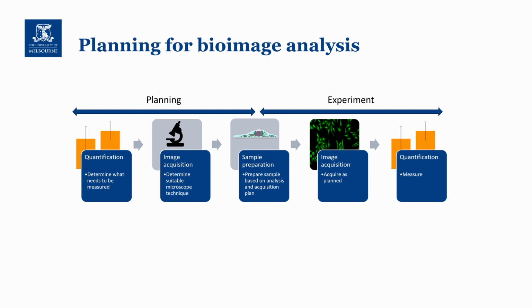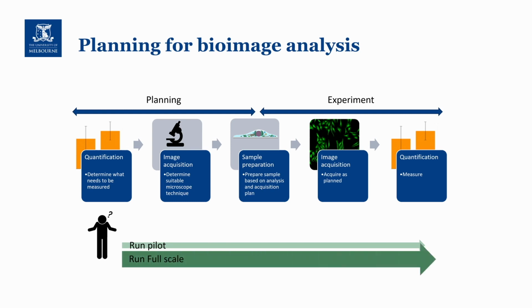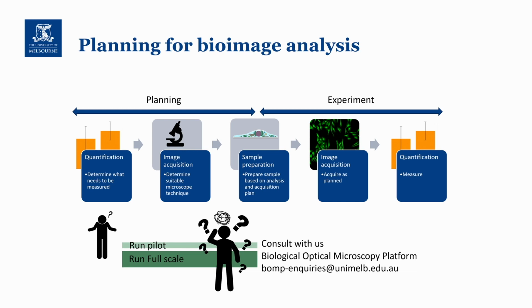So sometimes we might not know what feature we want to measure because the actual biology may be unknown or we are unsure how to measure it. So we should always carry out a pilot study before undertaking a major experiment. Also, if you're unsure if a microscope's specifications will be suitable for your image, it's another good time to run a pilot study. To organize a pilot study, you can email us and begin the initial consultation.